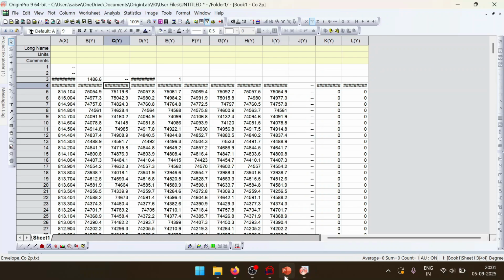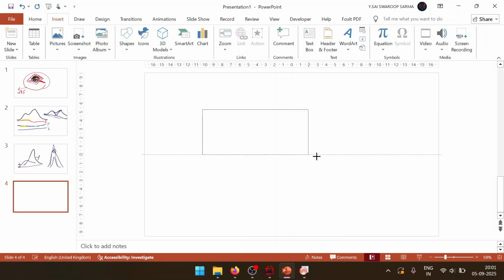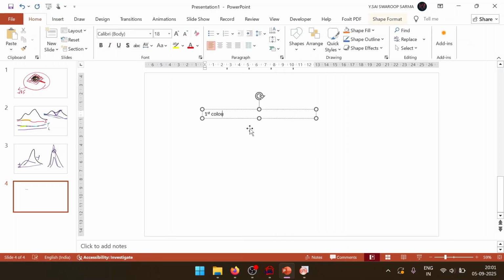So what you have is the first column, delete button, second and third column, cut and paste in first and second column, then the last in the third column. This is the thing that you should follow.